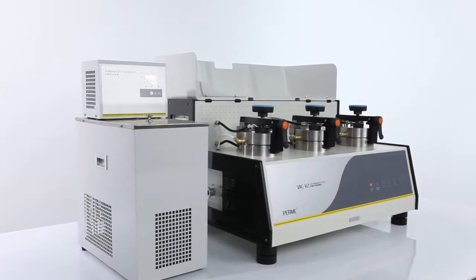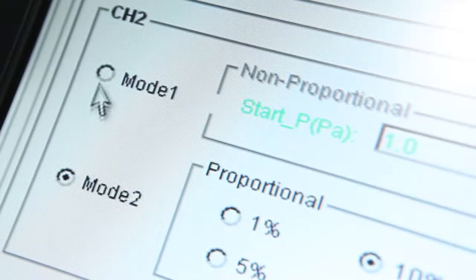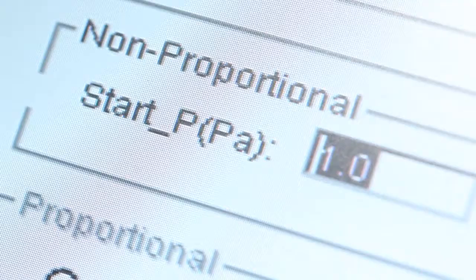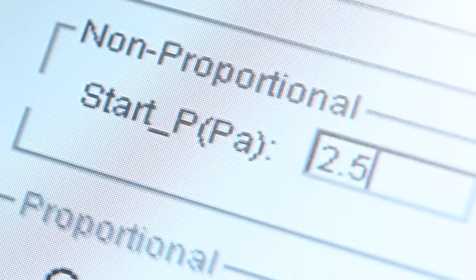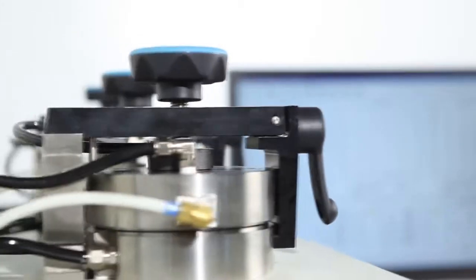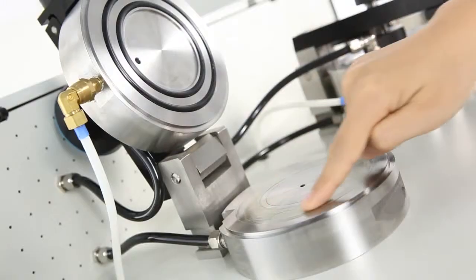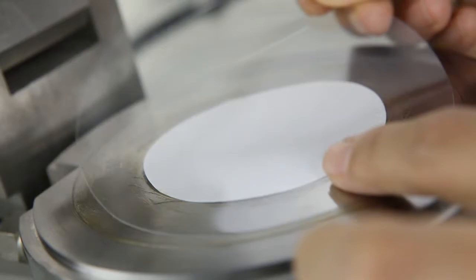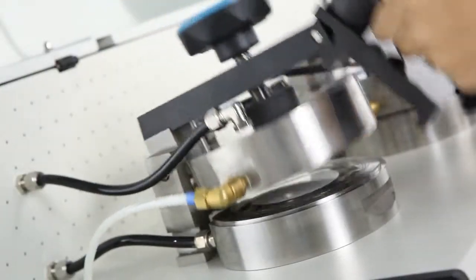The constant temperature and humidity control function and the proportional and non-proportional testing modes minimize errors caused by human factors during the testing process. The whole system can be easily and quickly calibrated using the standard films provided.